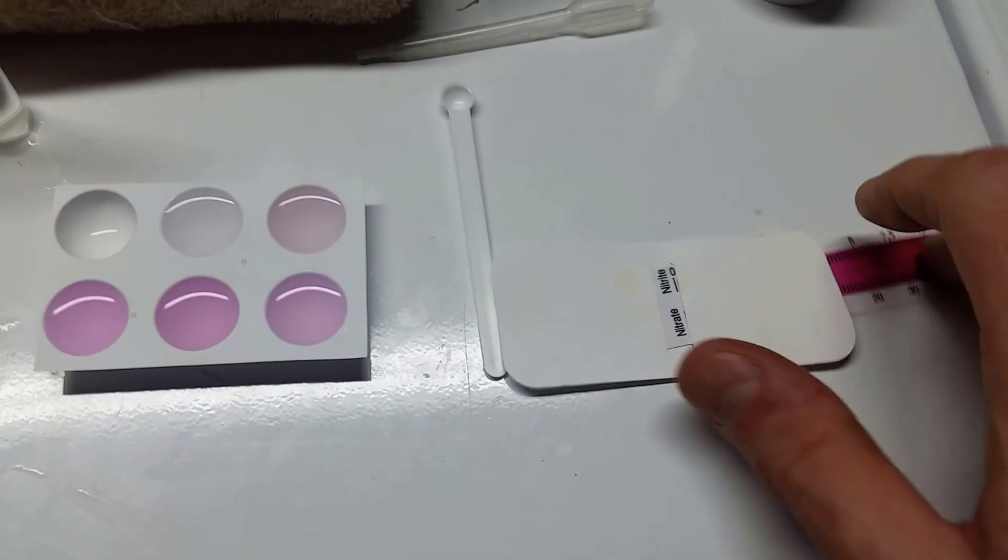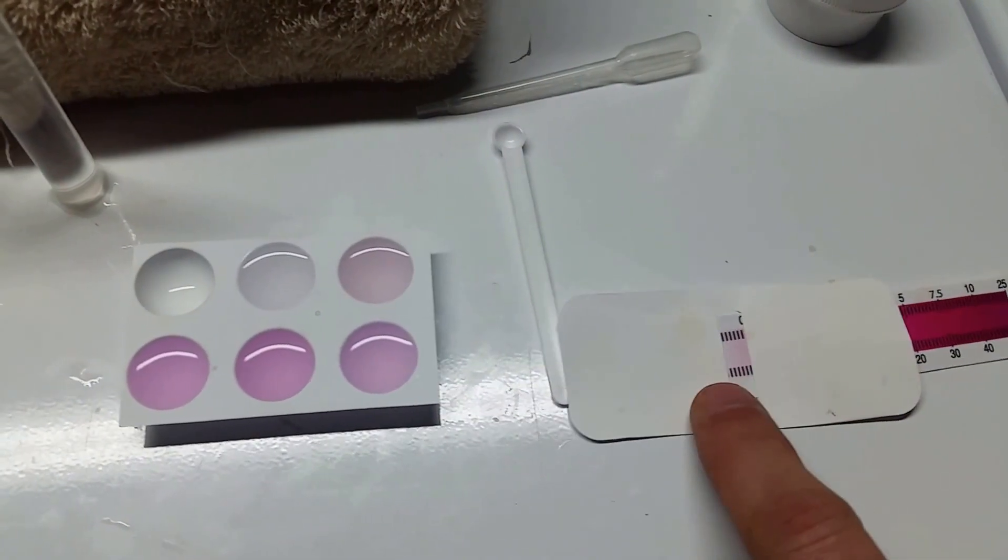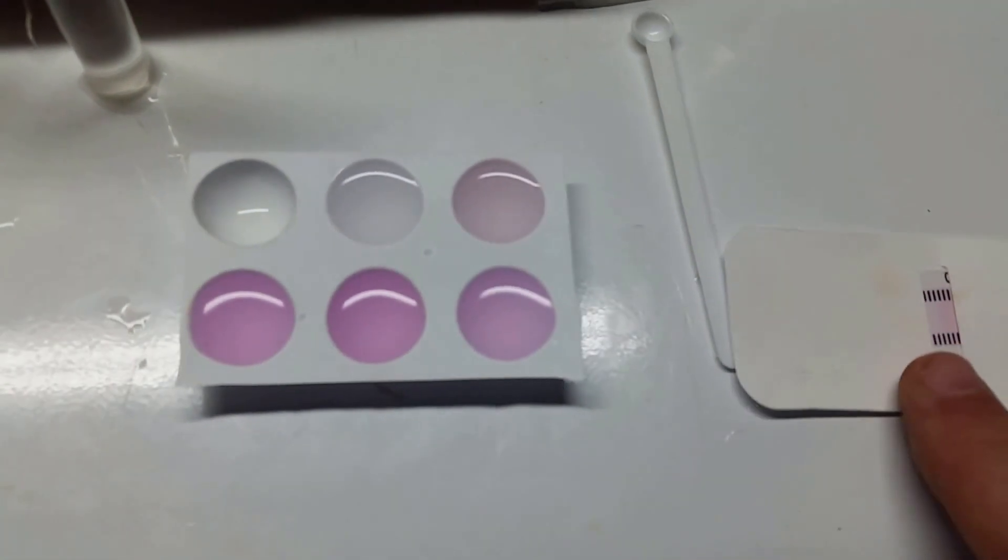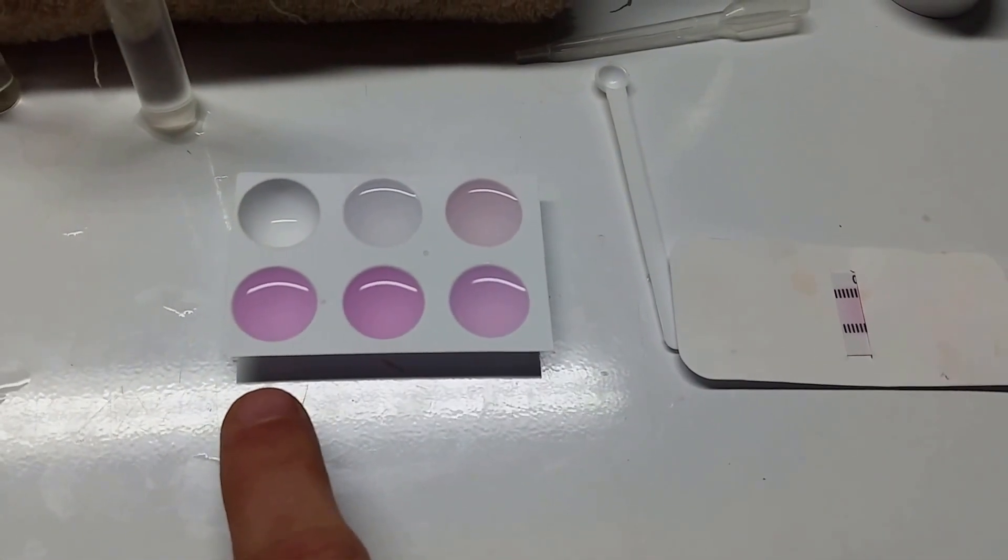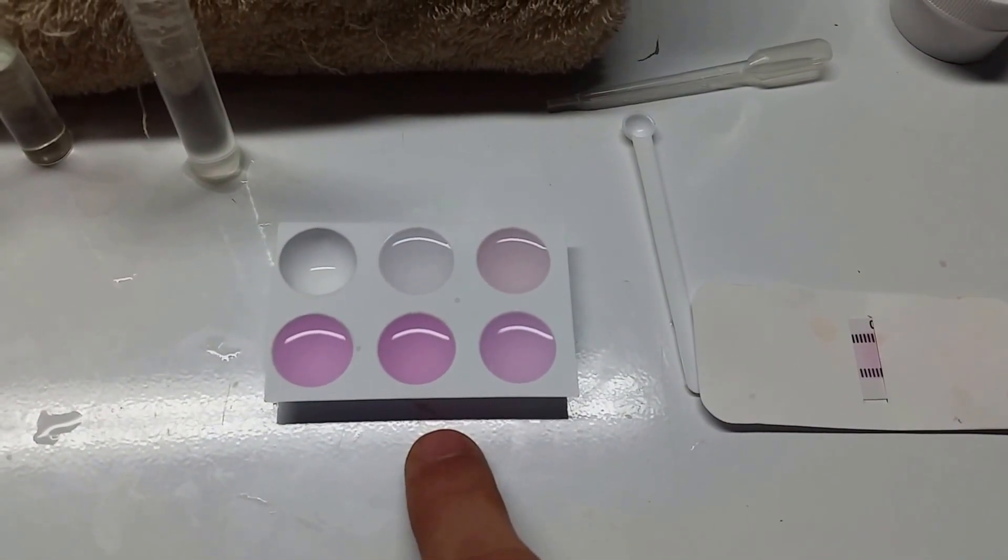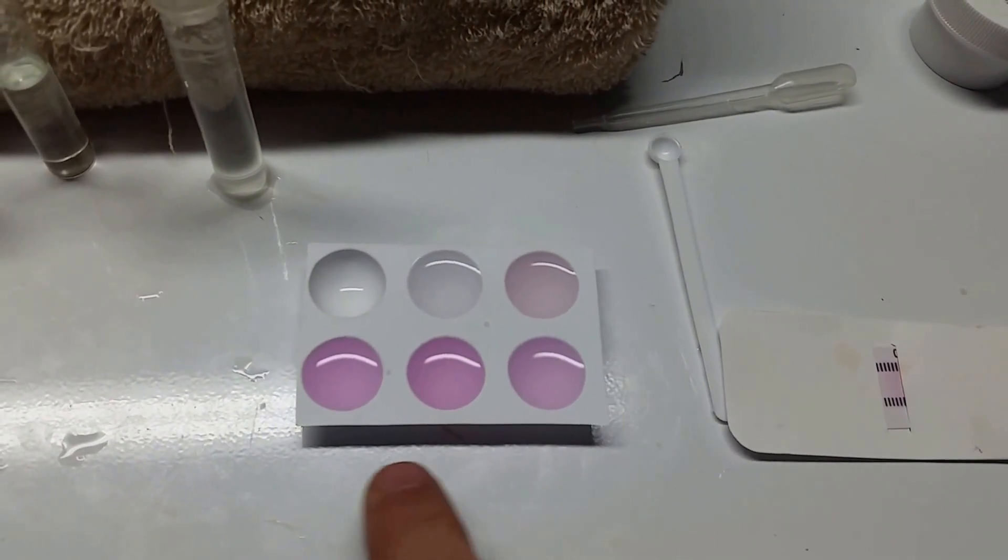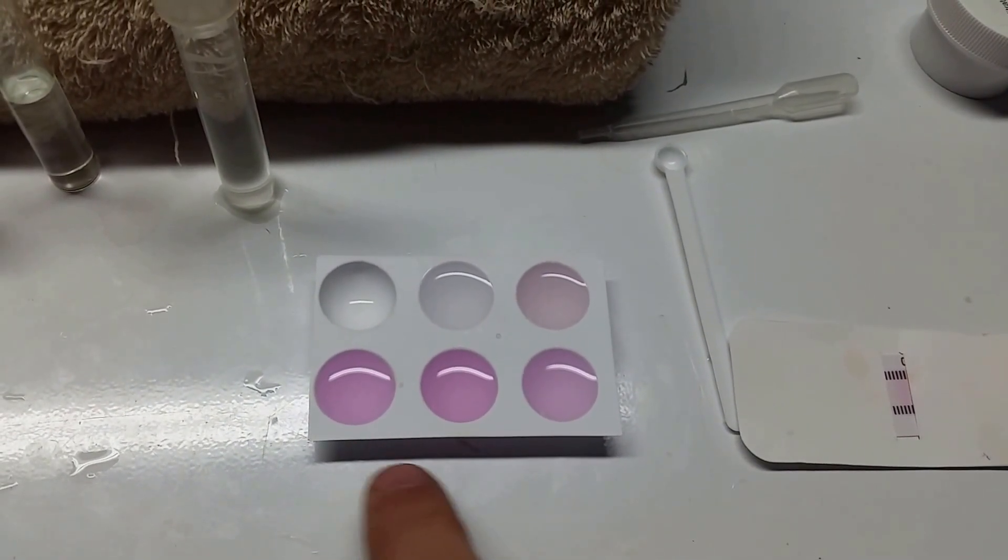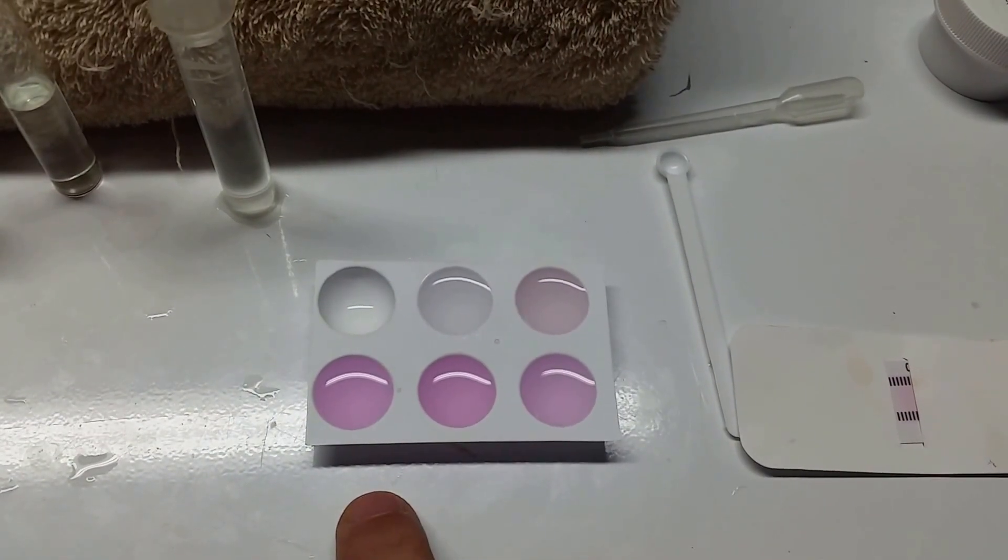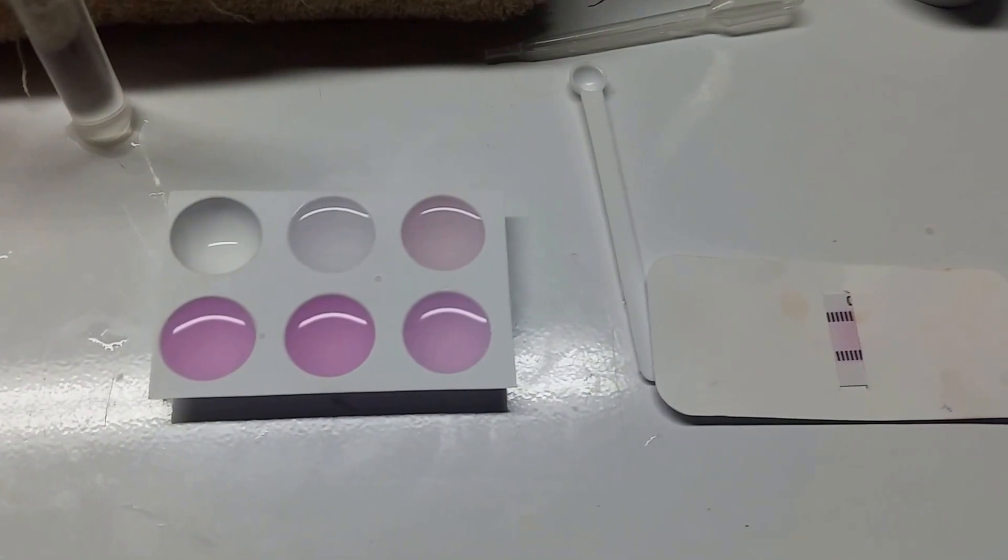That shading on this scale is ridiculously low - we're talking down to like 0.00, almost off the scale altogether. I can't really do this with one hand. This test is from last night at about 10 o'clock, a sample taken before the water change, which is actually a little darker than that. I know it's hard to tell, but it is ever so slightly darker, so I was still accumulating overnight.